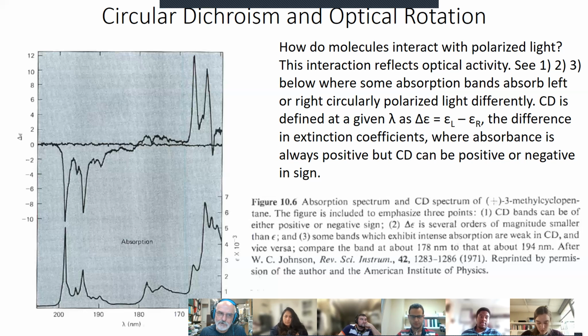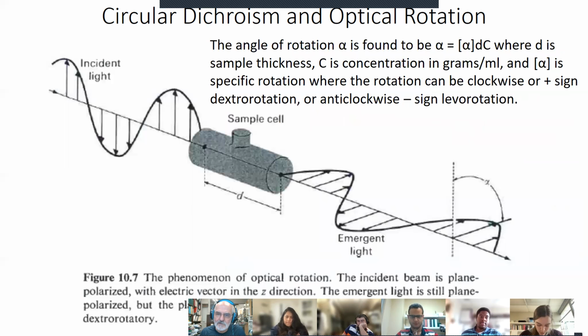It's not just the concentration of tyrosine, tryptophan. It's not just the presence of a 260 peak. It's also giving you explicit information about the tertiary structure, the secondary and tertiary structure of what's going on. Okay, mostly secondary in that example.